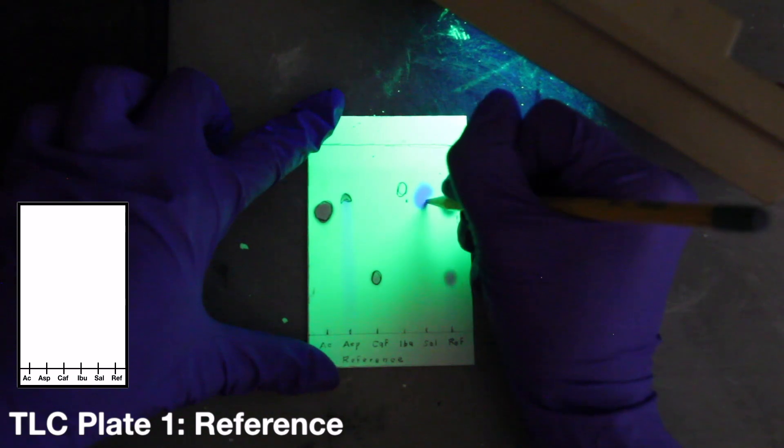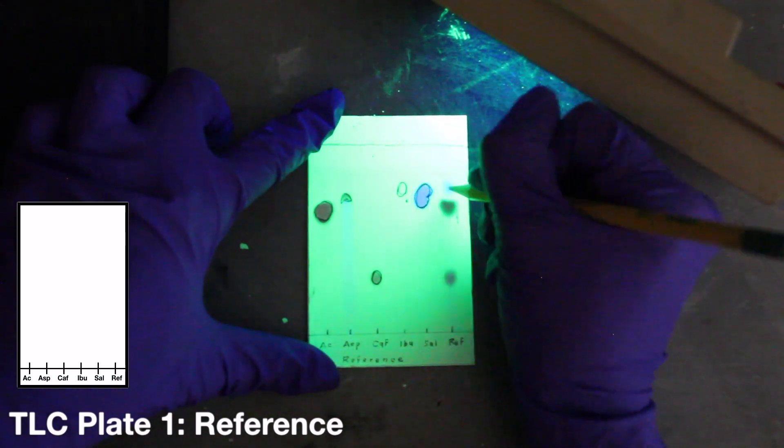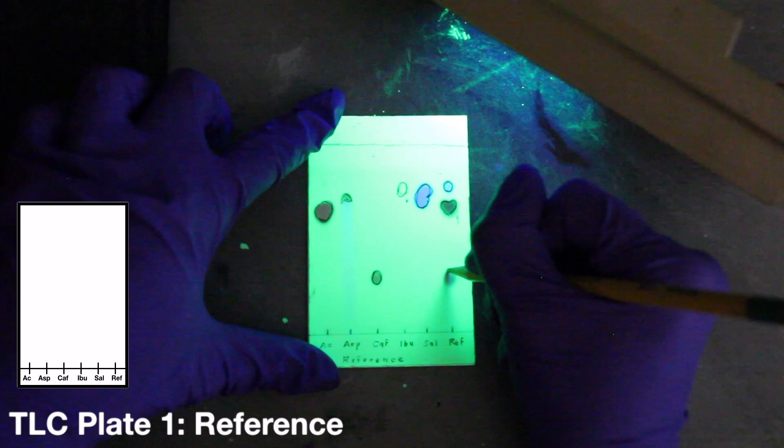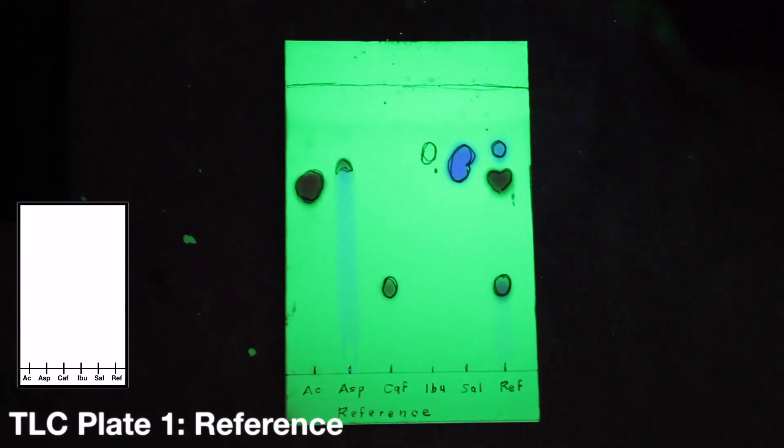For additional visualization, you can dip your plate in a jar containing a reactive solution and blot the excess solution with a paper towel. Notice which spots become visible and note their relative colors. Alternatively, you may place your TLC plate in a jar containing a few iodine crystals for a few minutes. As always, record your observations in your lab notebook.